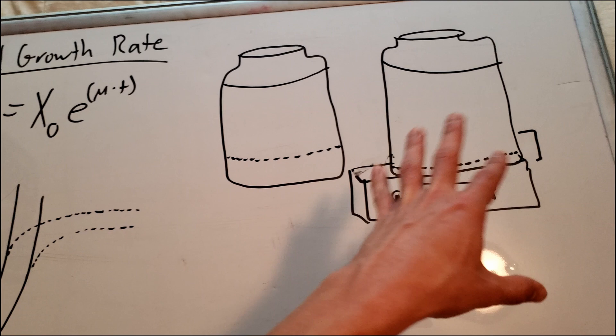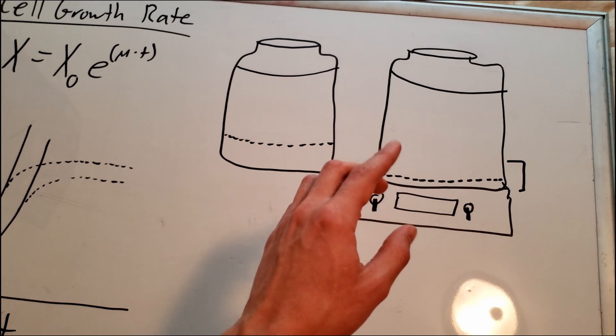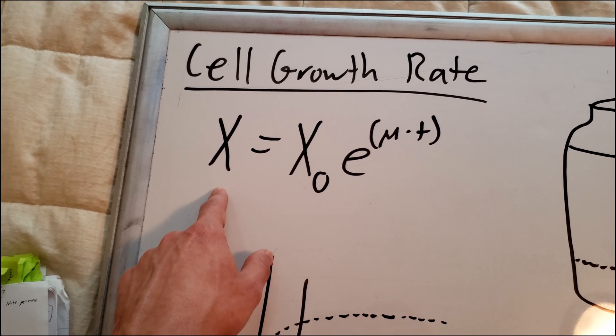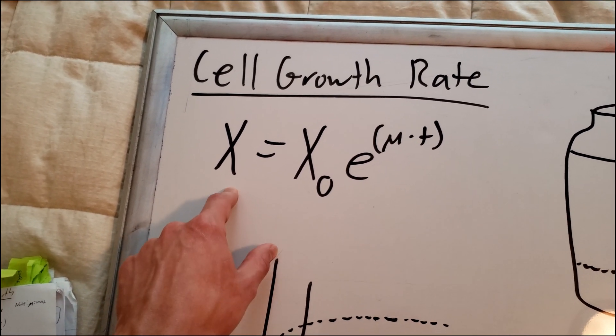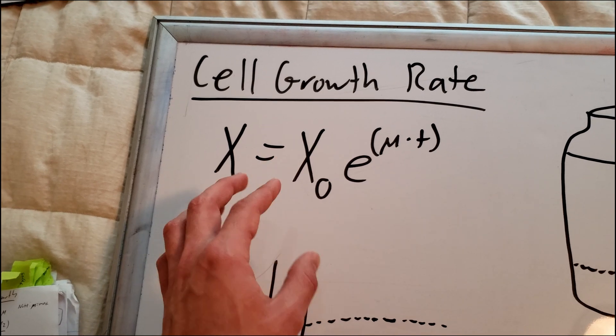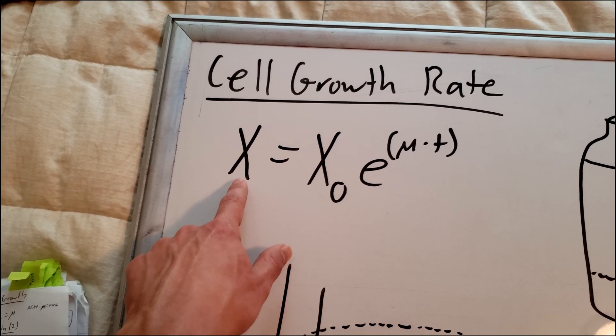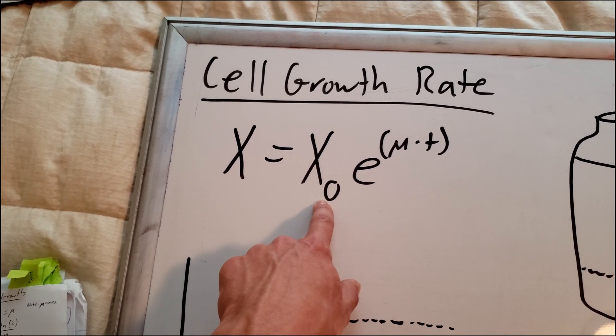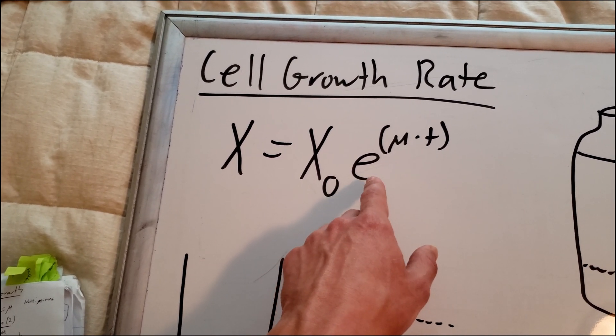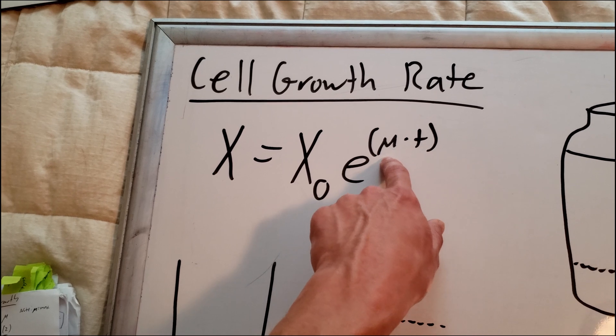So it started with less cells. So let's look at what influence starting with less cells would have on the fermentation process. So I had to dig up my old bioengineering notebook. And this is the equation for the number of cells in a reactor. This is a very basic equation. People dedicate their careers to studying cell growth rates and every organism is different. But this is a very basic exponential growth rate. So X represents our concentration of cells. X zero represents the initial concentration of cells. E is that number 2.7 something. Mu is the growth rate. And T is time.